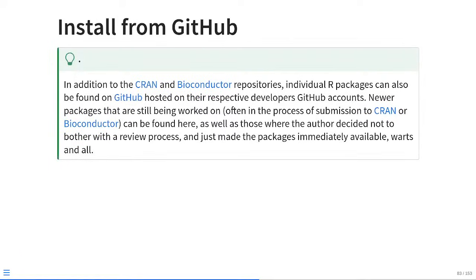There we go. Now, at this point, we've downloaded packages from both CRAN, which is the main repository, and Bioconductor, which is the more specialized repository. So the last one we need to cover for today is the GitHub repository.